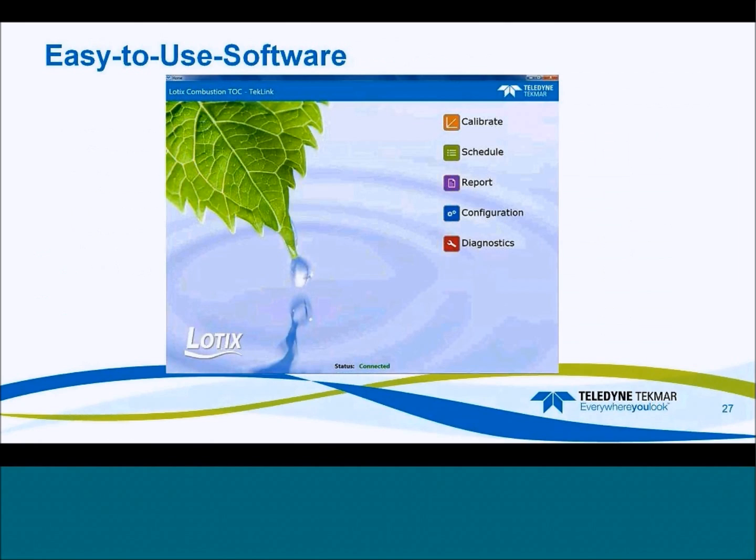So this is our software. As I mentioned earlier, we had to change one of the parameters in our method, so I'm going to show you guys how to do that in the software. I'm going to go over the software as well. It's built to look kind of like an application that we're used to seeing in our everyday life, and so it's super easy to navigate. You don't need all the clicks to make a calibration or to edit anything. It's just an easy-to-use software.